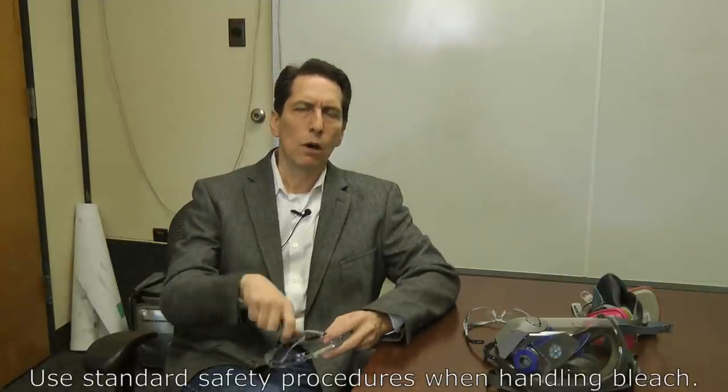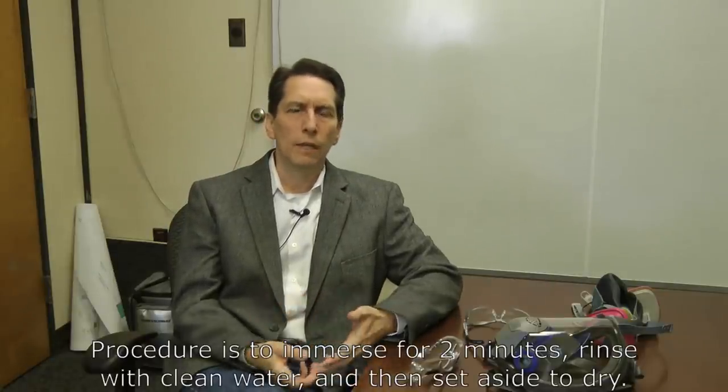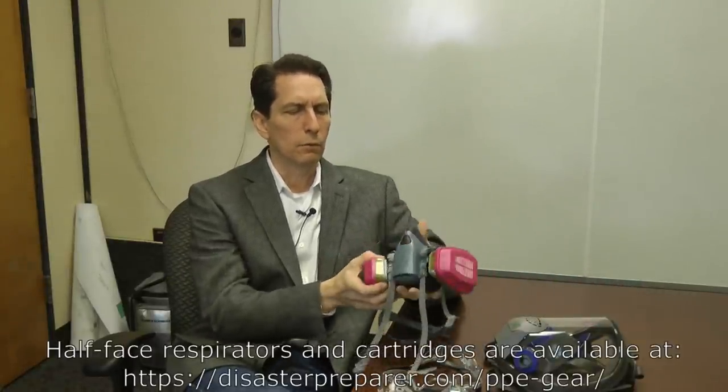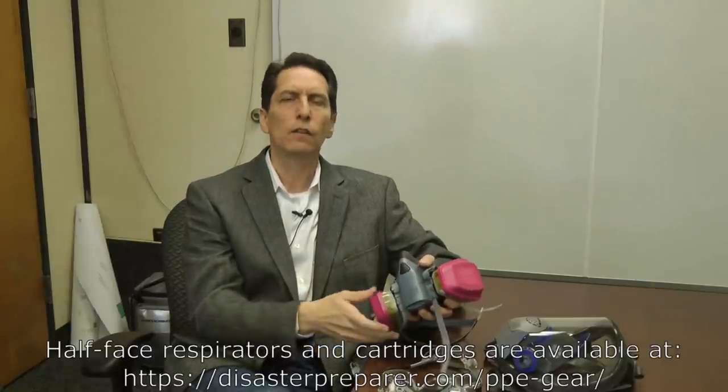To disinfect a hard item, create the bleach solution, put the item fully submerged into the mixture using tongs if needed, and let it sit for two minutes. After two minutes, remove the item, rinse it with fresh water, and set it aside to dry. This method applies to glasses and to respirators like this half-face respirator — remove the cartridges, put the mask body into the solution, let it sit two minutes, rinse, and let it dry.